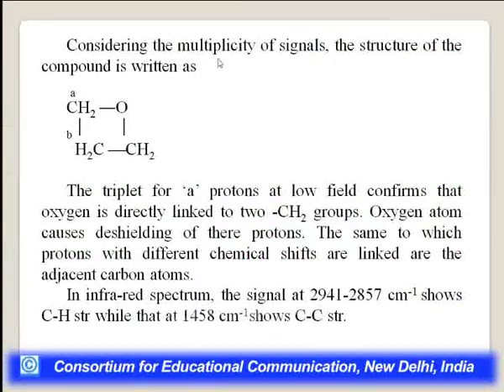So considering the multiplicity, you know what multiplicity is? When we talk about the splitting pattern, if you don't understand, you go back to NMR spectroscopy and see the splitting pattern, and this is the multiplicity of signals. And the structure of the compound can be written like this: the triplet of A protons at low field. Now we have to see whether they are at low field or high field, which confirms that oxygen is directly linked to two CH2 groups.